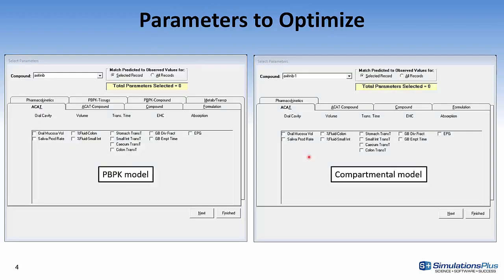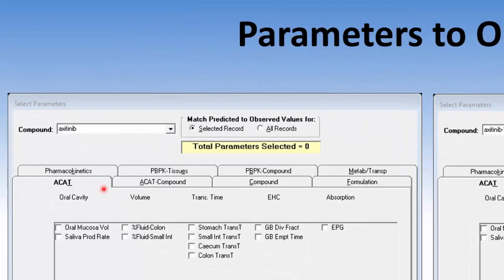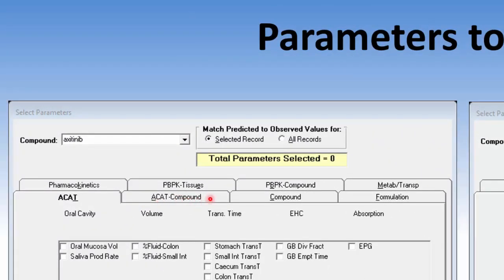These two dialog boxes are presented for the parameters to optimize. On the left, I show optimizing values for a PBPK model and on the right for a compartmental model. Some PBPK tabs on the left are not shown on the right because they aren't involved in the compartmental model. The parameters to optimize are broken up into ACAT parameters for the compound, compound parameters, formulation, pharmacokinetics, PBPK tissues, compound, metabolism, and transporter properties.